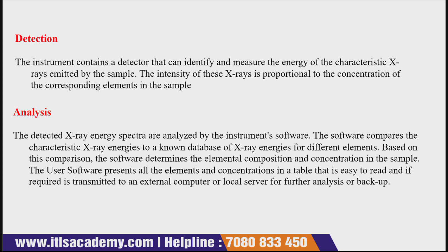The software compares the characteristic X-ray energies to a known database of X-rays for different elements. Based on this comparison, the software determines the elemental composition and concentration, which play a very important role in the analysis of any sample.